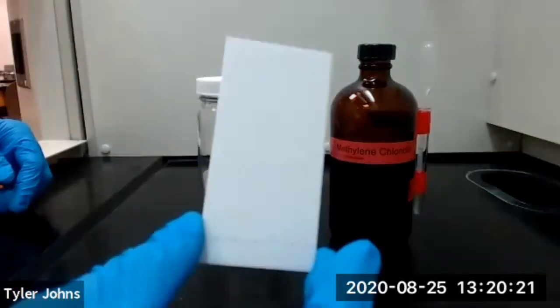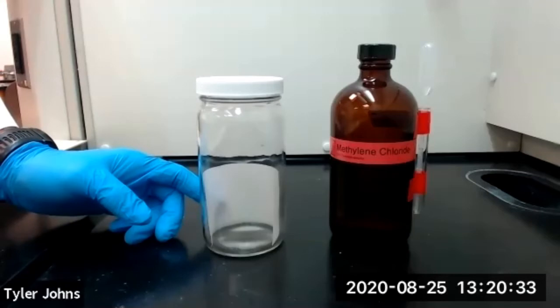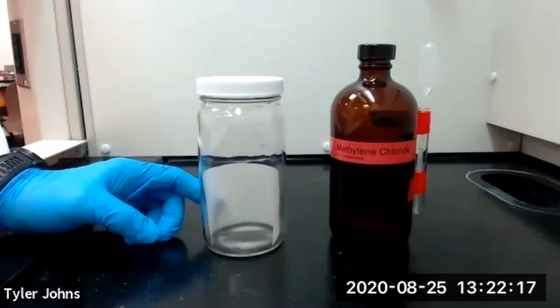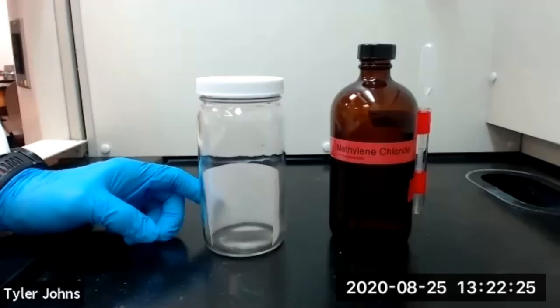We'll then place our TLC plate inside the development chamber and allow the TLC plate to develop. We'll remove the TLC plate once the solvent front is within one to two centimeters of the top of the TLC plate. And you need to remember to mark the position of the solvent front on the TLC plate as soon as you remove the TLC plate from the development chamber. This way you can calculate your RF values.